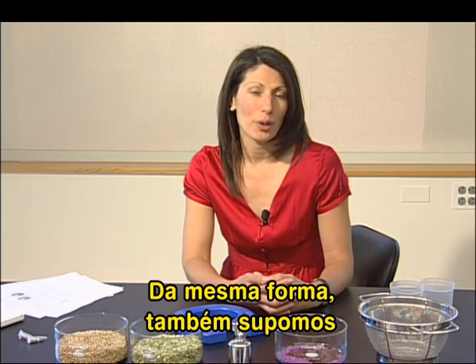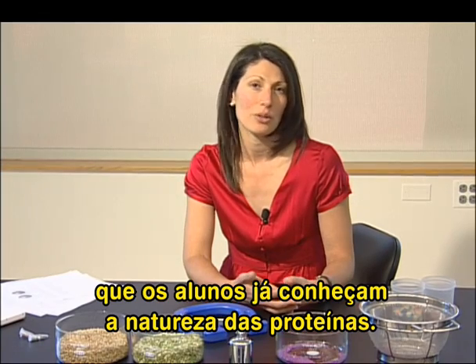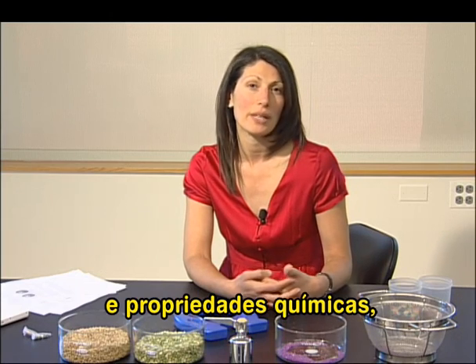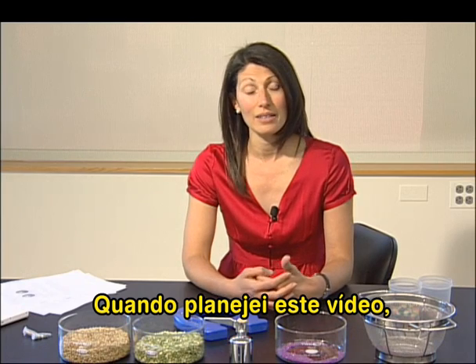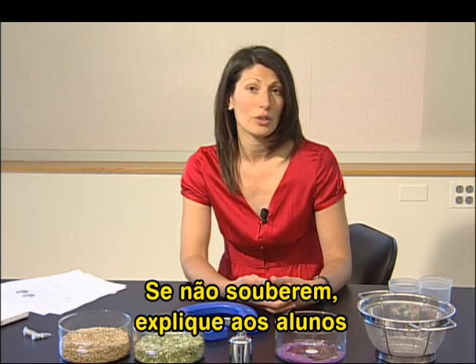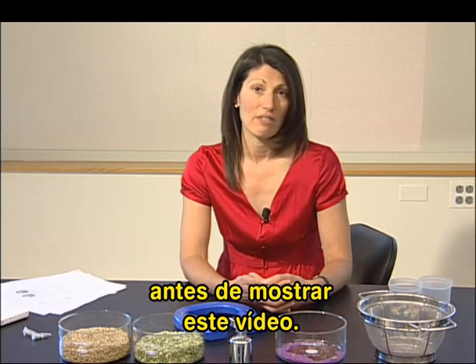Similarly, the nature of proteins is also sort of presumed to have been understood by your students already. So things like proteins coming in different shapes and sizes and having different chemical properties like charge and density. That is something in designing this video that I've assumed you may have covered with your students already. And if not, you may want to cover with your students explicitly in advance of running this separation video.